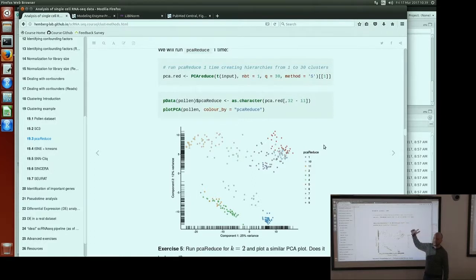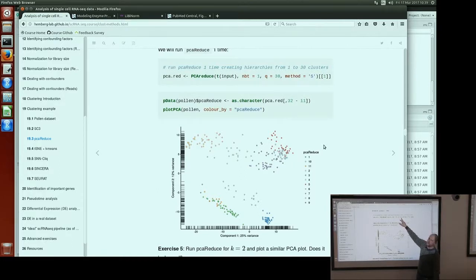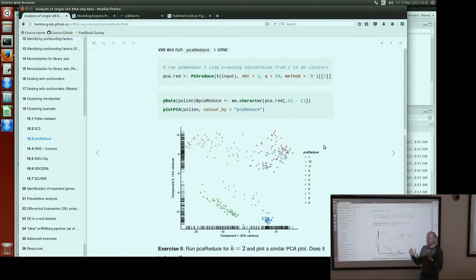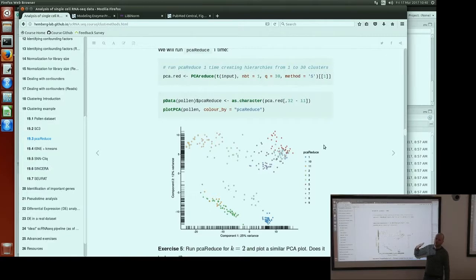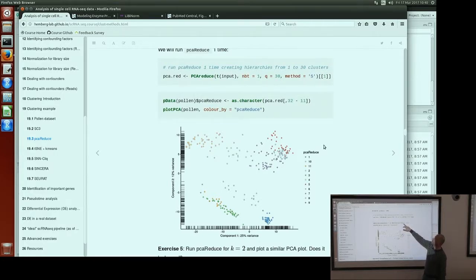PCA-reduce uses iterative hierarchical clustering, doing PCA and k-means at every step. It starts from 30 clusters and then merges, doing 30 steps — at every step merging two clusters together. That's why in the result you actually have a hierarchy of your cells from 2 clusters to 30. Because we're interested in k equals 11, we need to extract that solution from the data matrix. You actually have 30 solutions for k from 2 to 30. The 30 is the starting parameter you need to define.